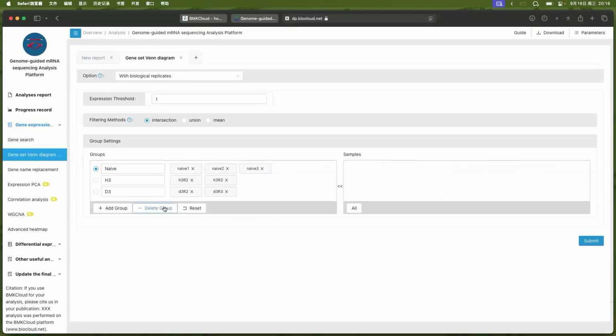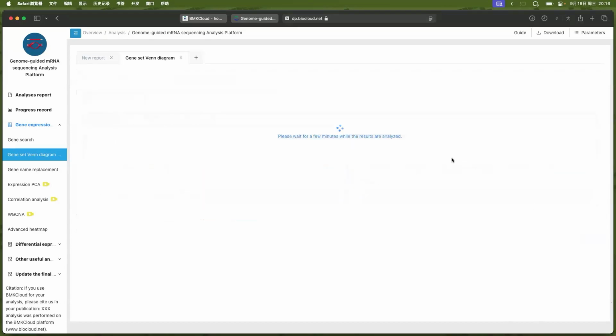So after we select this, we can submit the analysis. This may take some time. This depends on how many genes you have. Please wait a minute for this result.